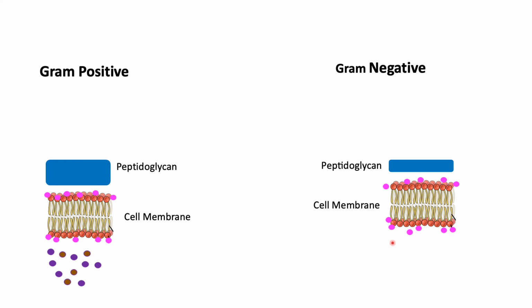So if I looked under a microscope and I only saw pink, I would say, okay, this is gram-negative bacteria. But if I looked under the microscope and I saw purple, I would say, okay, it's gram-positive. And keep in mind that it has the pink, it has the safranin, and it has the crystal violet. But we see purple because the purple masks the pink of the safranin. So that's how we identify whether a bacteria cell culture is gram-positive or gram-negative.